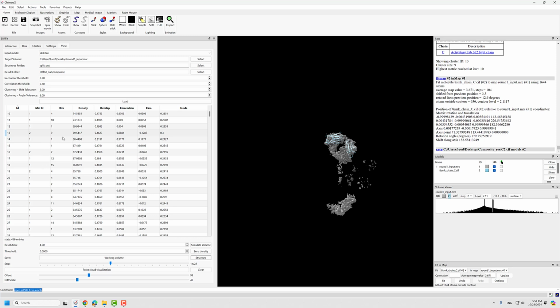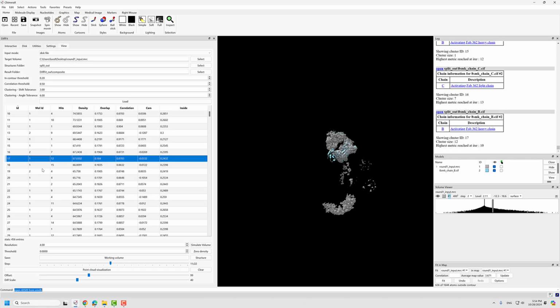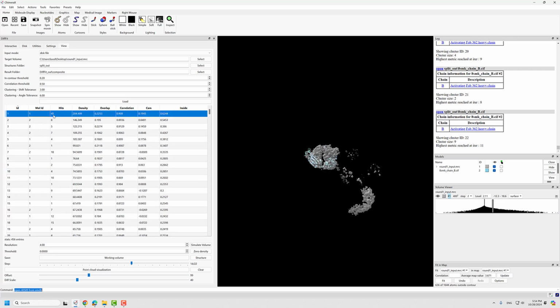Now there's supposed to be one more at the bottom. Let's see which one is that. I remember I saw it. Oh, yeah.